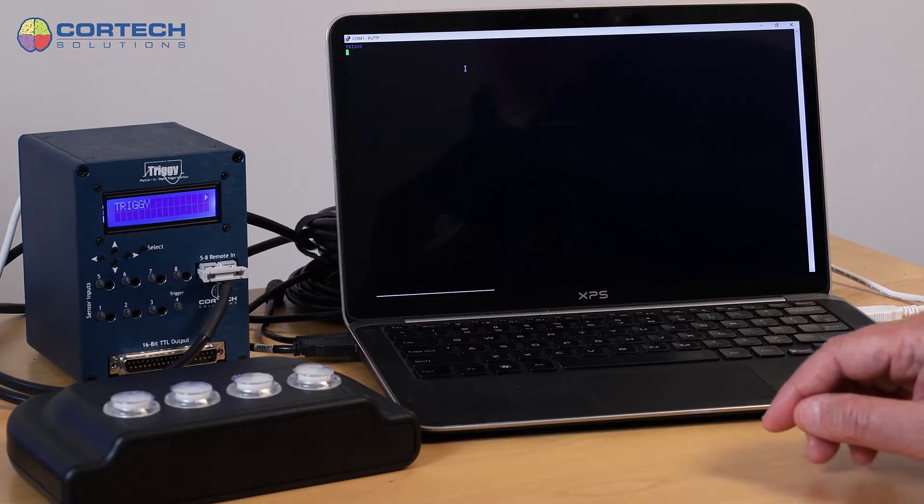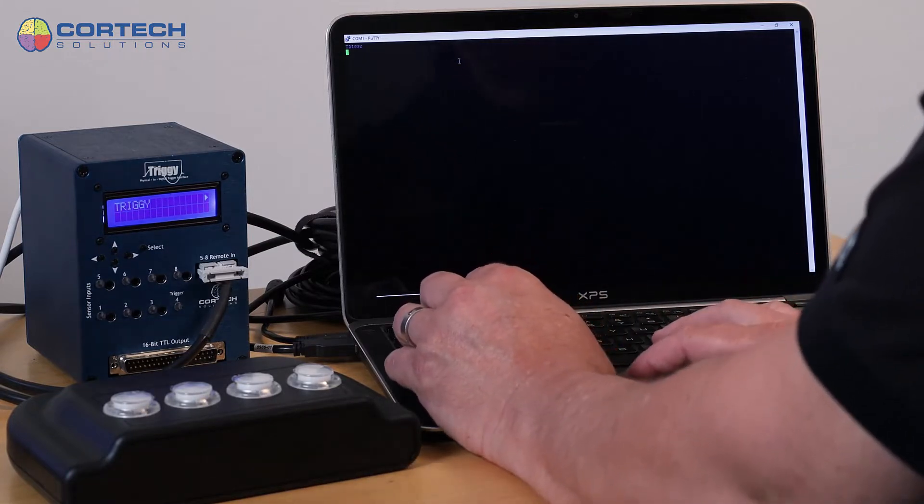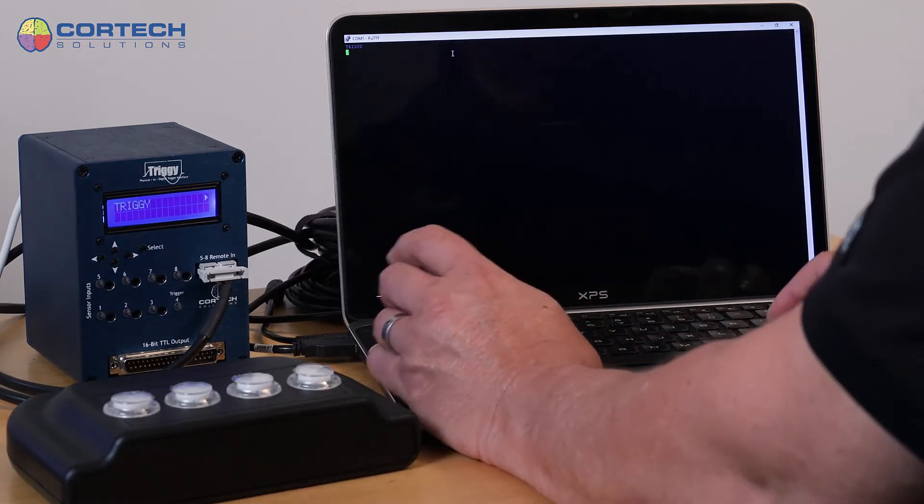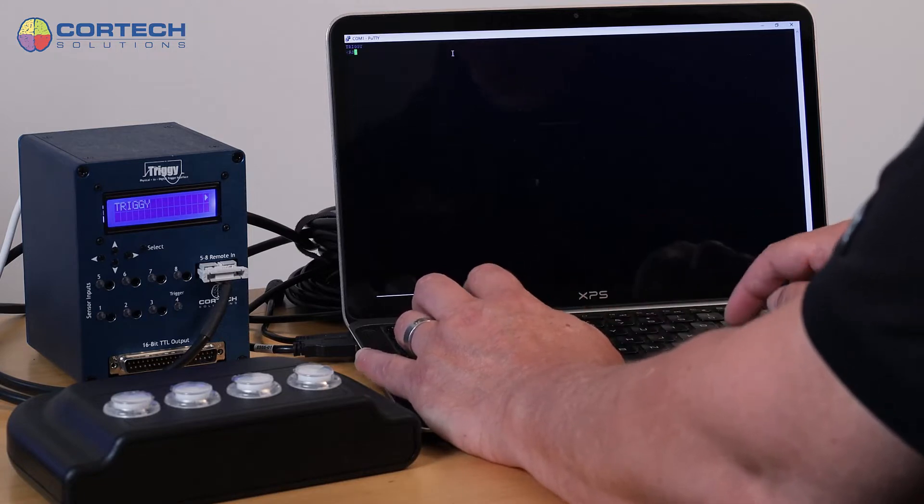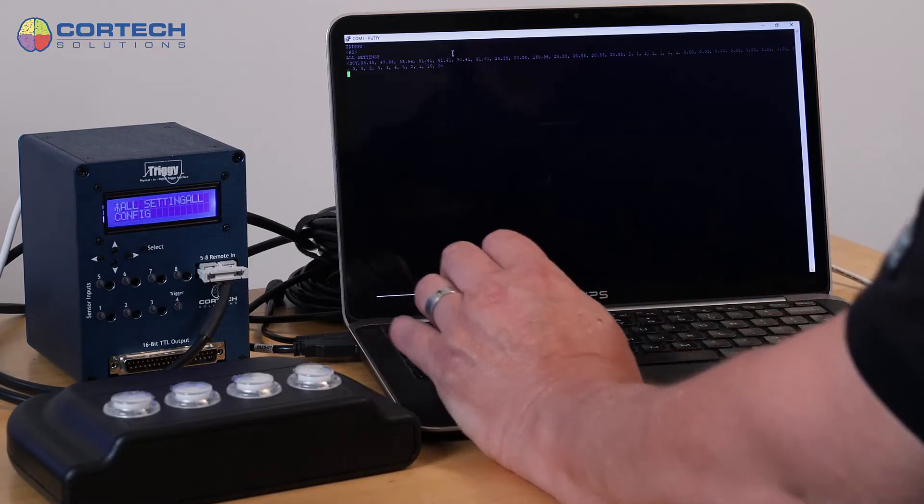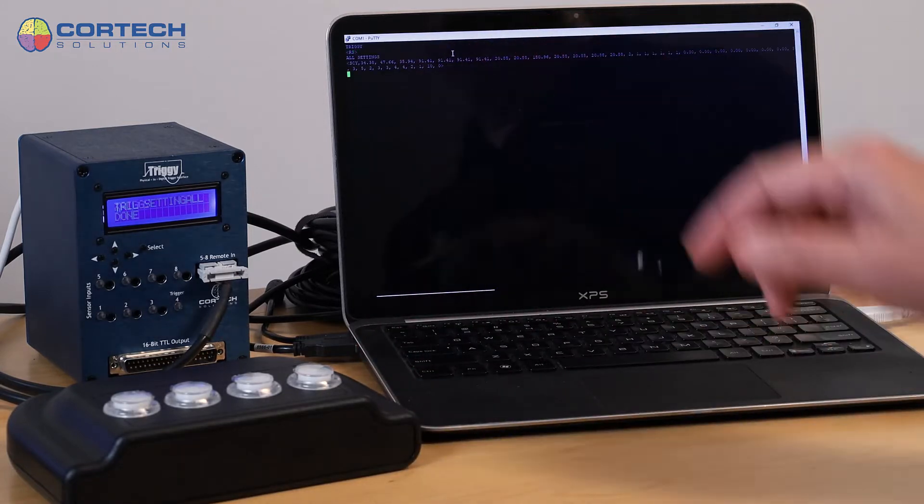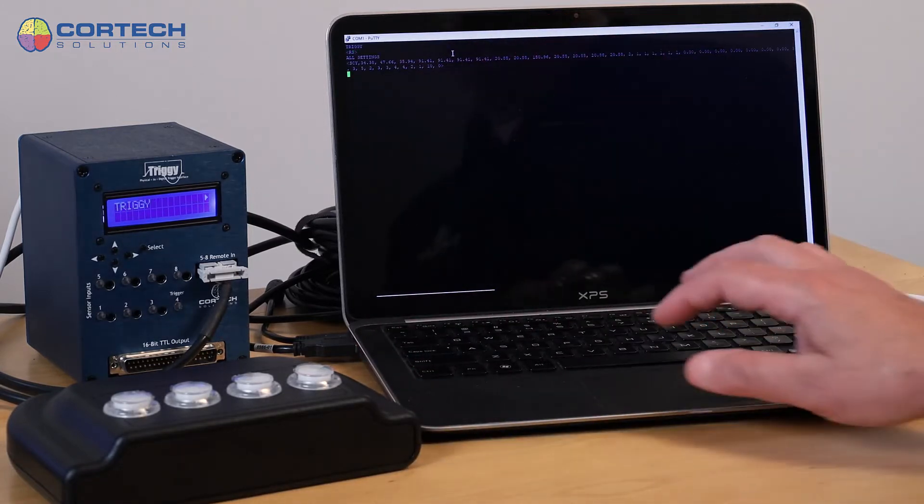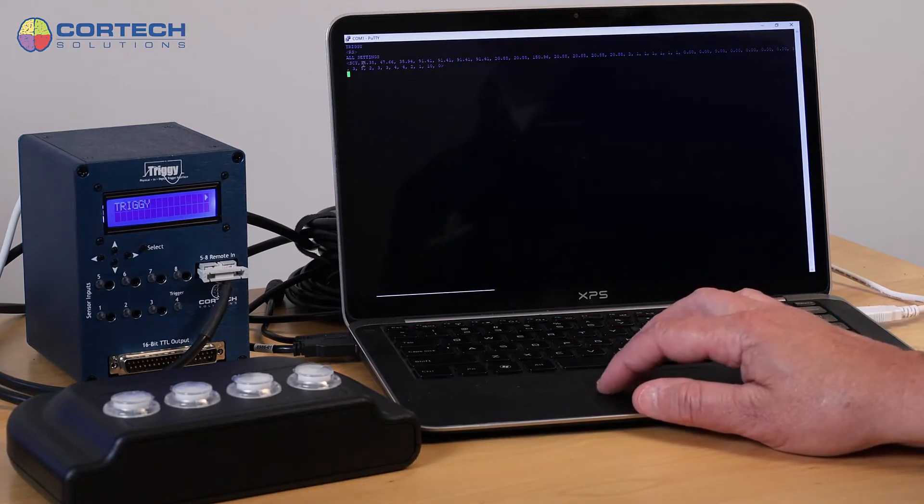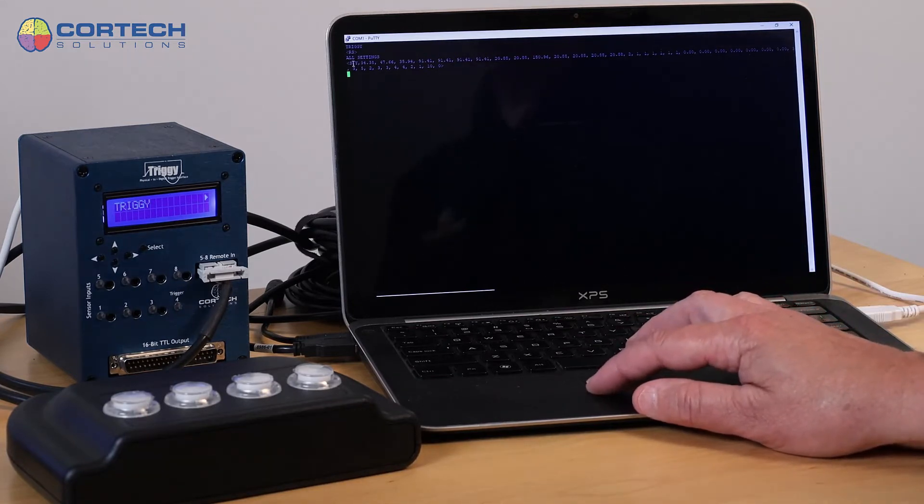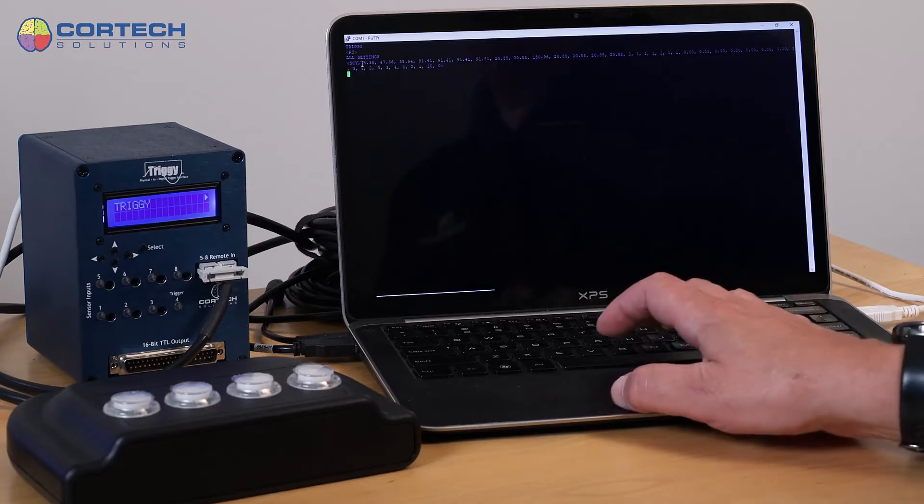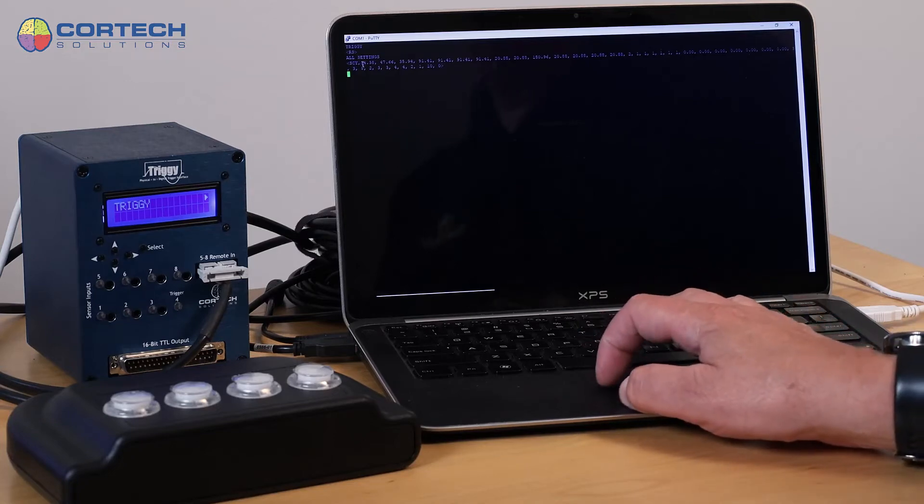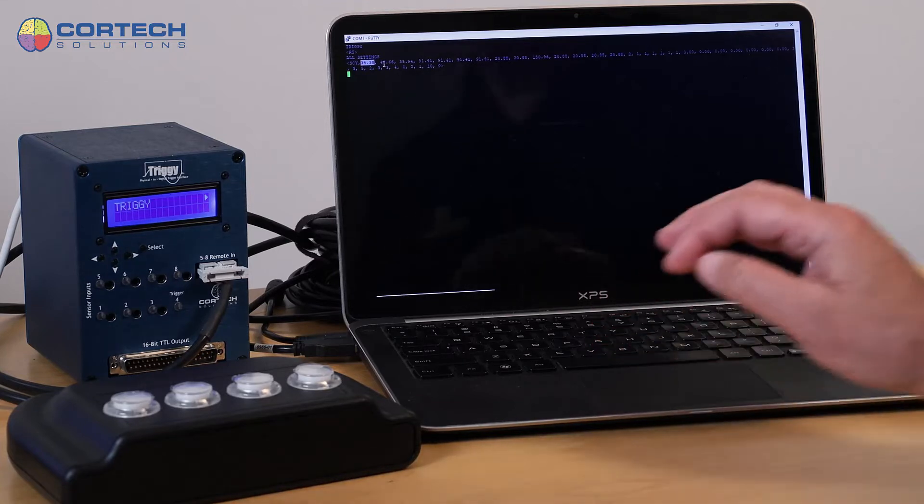So what I'm going to do is just on the keyboard of this computer, enter RS, and you'll see that it returns the current settings. So the current settings, for example, include the threshold for the first channel, 34.38.